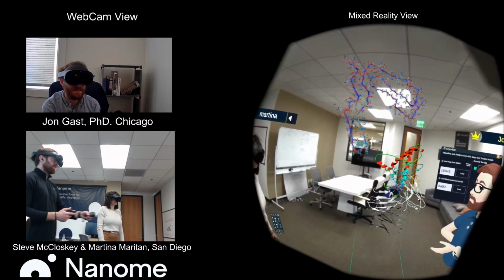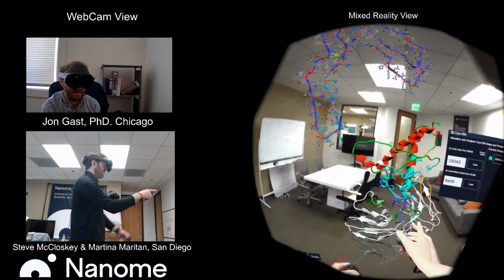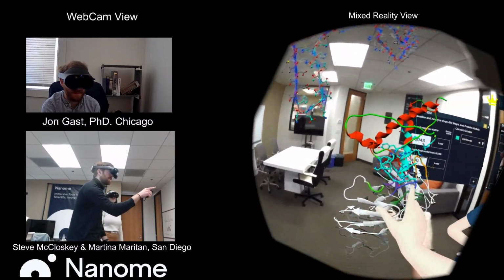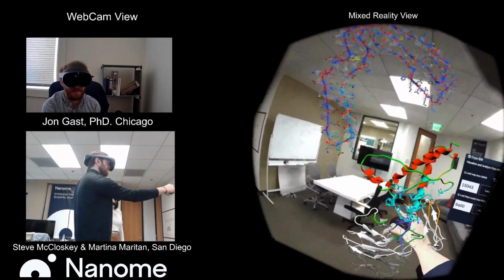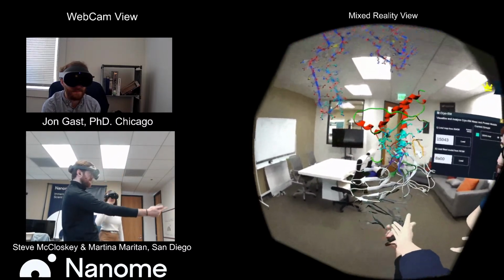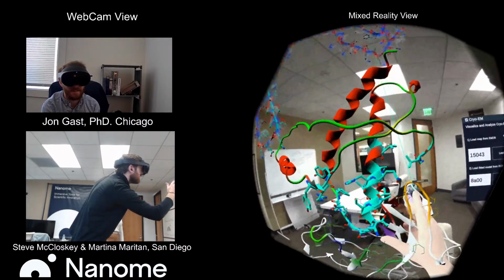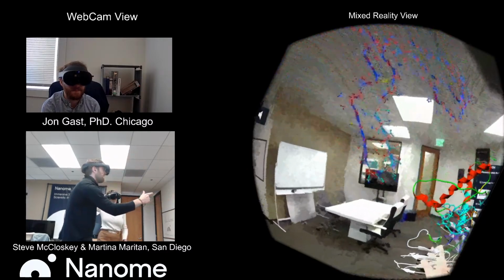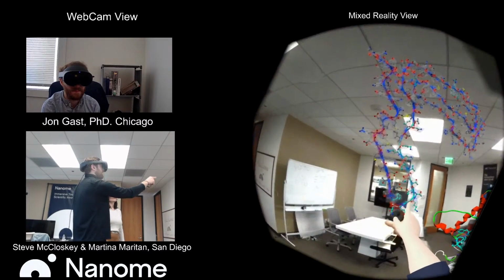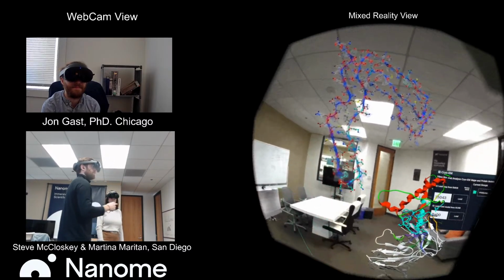Definitely. And yeah, we could see the CDR loops highlighted in the various color scheme. We have the greens, the blue, the orange, red, and purple, indicating all the CDR loops of our antibody structure here. And we can see that those are really nicely forming with key residue interactions, which are also correlated with the protein structure in the 2D state.